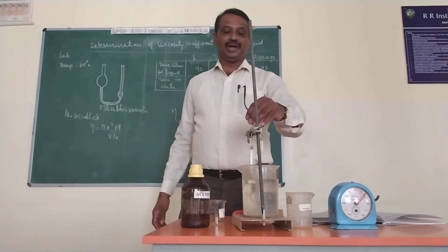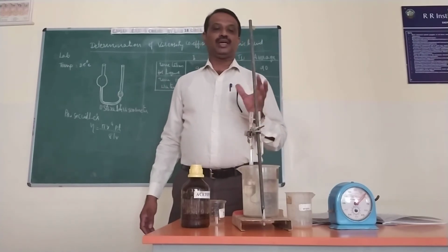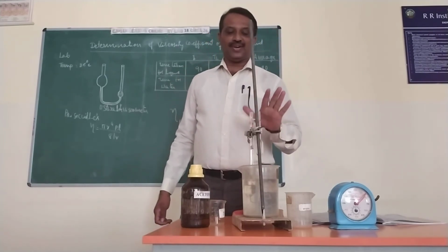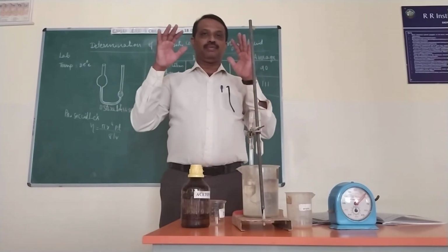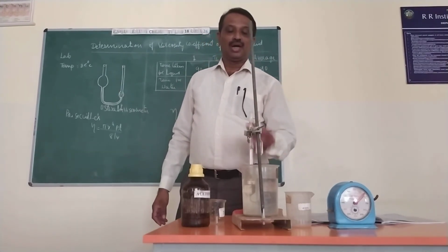The larger bulb is completely immersed into the water, because viscosity and the viscosity coefficient are affected by temperature. Even with variation of the temperature, the movement of liquid from upper end to lower end varies.